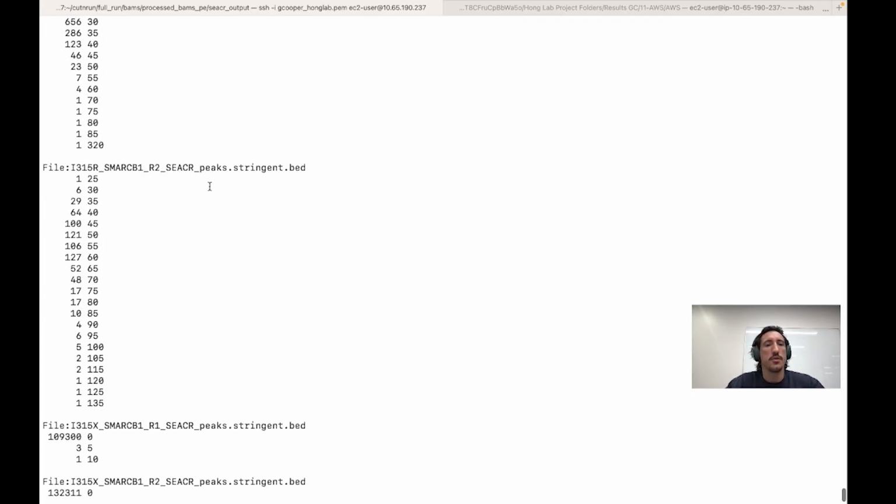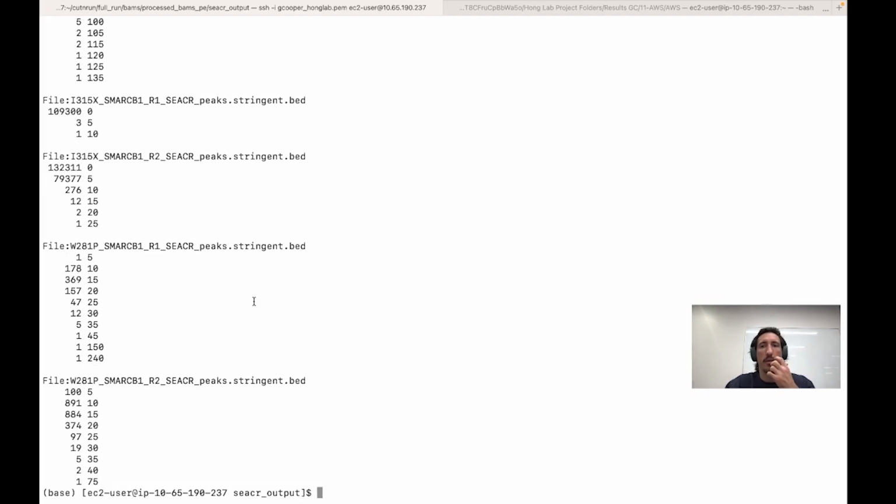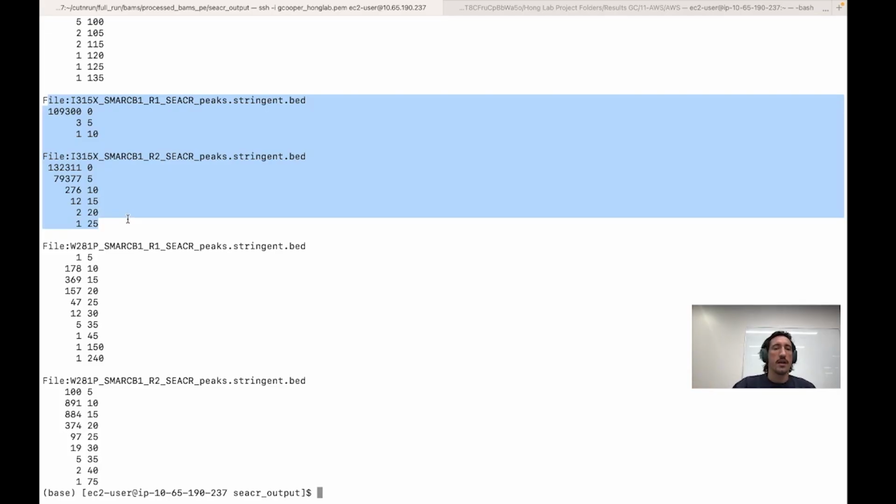So we need to apply a hard filter to our bed files. And when we do this, we're actually doing two things. For all the other samples, we're pretty much just cleaning things up. We're removing marginal peaks that snuck through. And I recommend doing this for any CUT&RUN data set, really. But for our tricky samples, we're honestly asking, are there any real peaks here, or is this actually just complete loss of function? All right, so let's do this filtering.